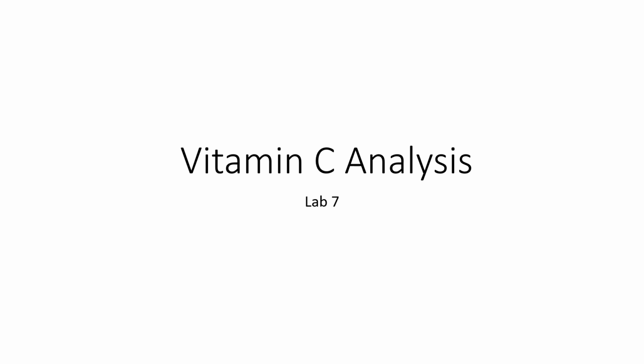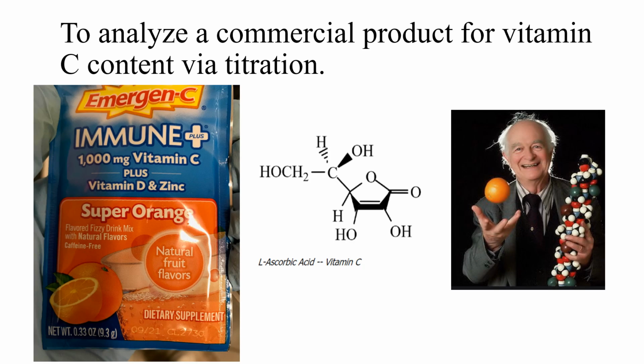In lab number 7, we're going to learn how to use the redox titration method to quantify vitamin C content in a commercial product. So in this lab, we're trying to analyze a commercial product for vitamin C content via redox titration.